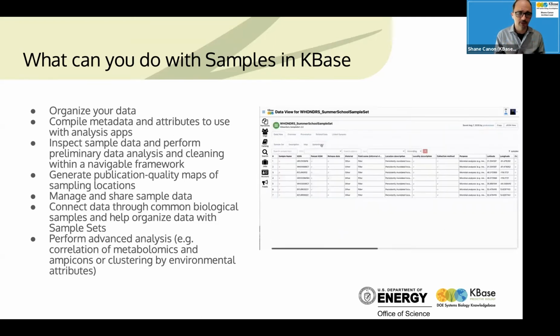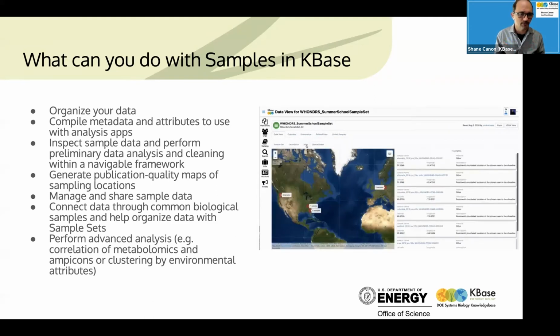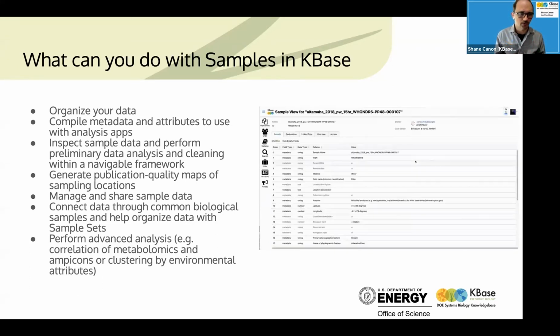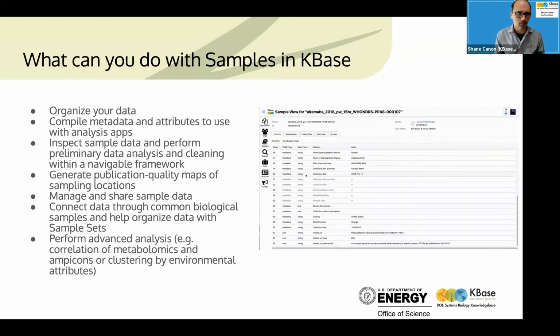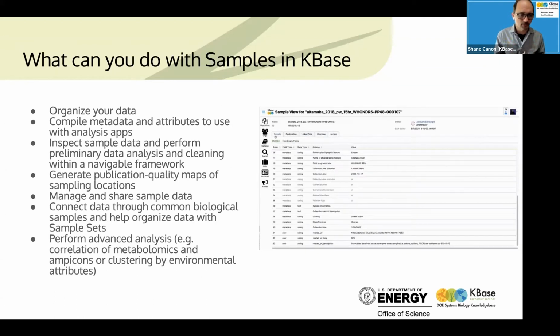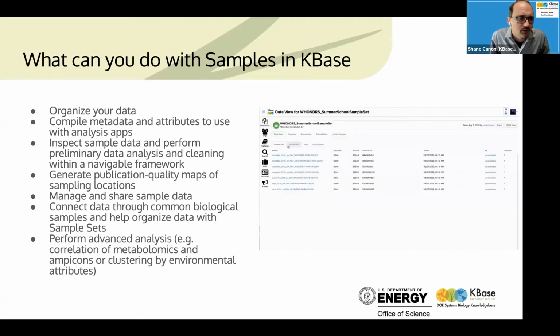It can generate various types of visual elements, including maps. You can manage these so that you can share them with your organization or with colleagues or collaborators, and eventually publish them. And then you can use these to connect, again, various measurement data, and use this to perform analysis. So you'll see the details of that later. Next slide.